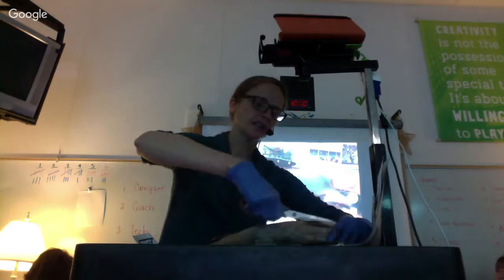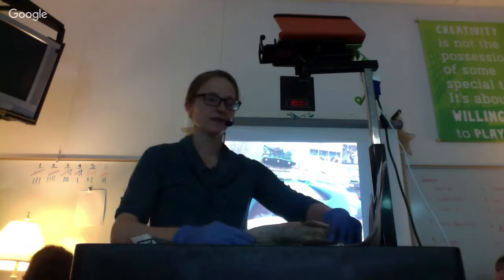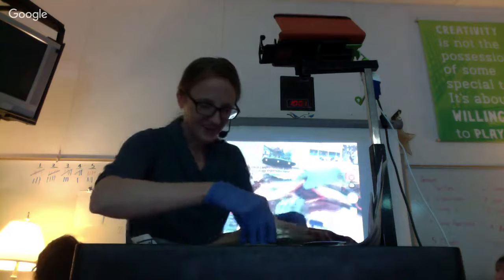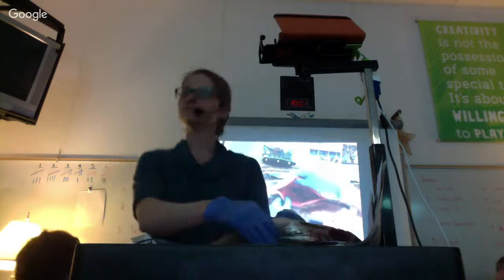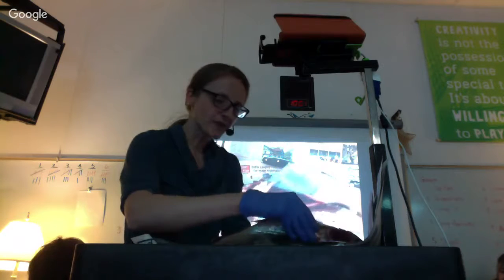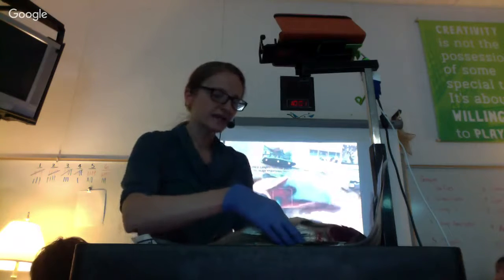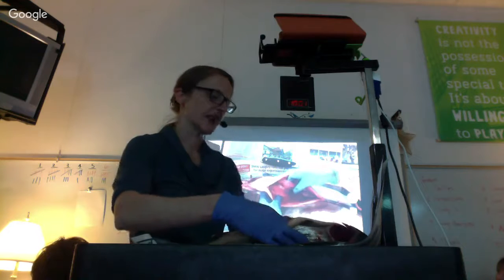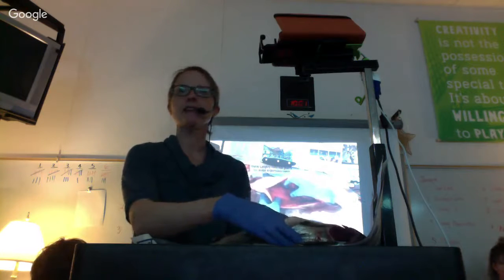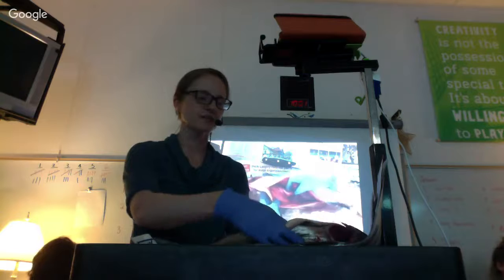I'm going to predict this one is a female. Put up your hand if you think it's a female. Yeah. Put up your hand if you think it's male. Can I have a drum roll, please? Okay. So it's a male. Yes. Okay, and the reason why I know it's a male is because it does not have any eggs. It has these two sacs, and these two sacs are milt. Okay, so when you open it up, you'll see eggs, like as if you're in a sushi restaurant, or you'll see milt. So I have a boy.